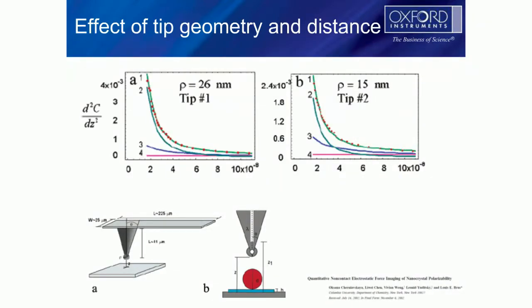This paper I think was Li Wei Chen, and I believe he was in the Bruce group when he did this. I can't read that, it's too small. So this is a simple model that they use to represent the cantilever. If we look at the pink part, that's the cantilever. The green part is the tip apex, and the blue is the cone. You've got different tip radii and all that, but the key thing to understand is that the right is away from the surface, and the left is towards the surface.